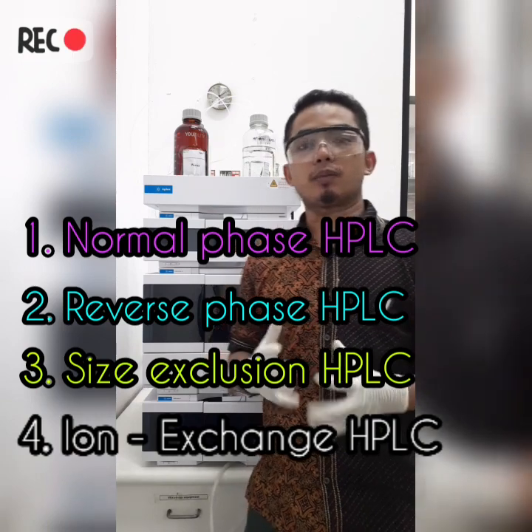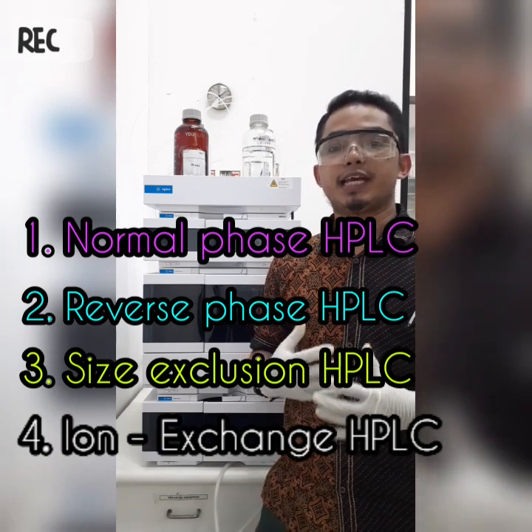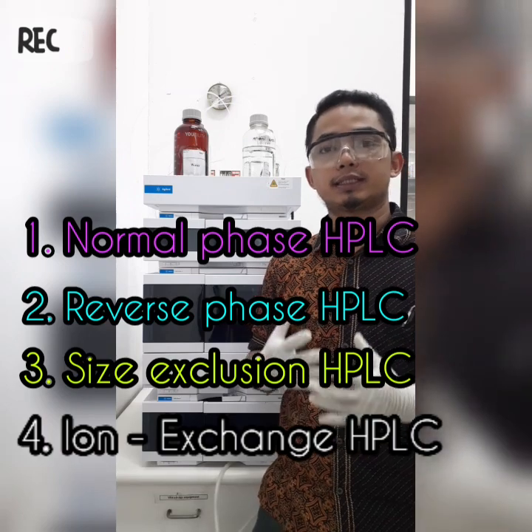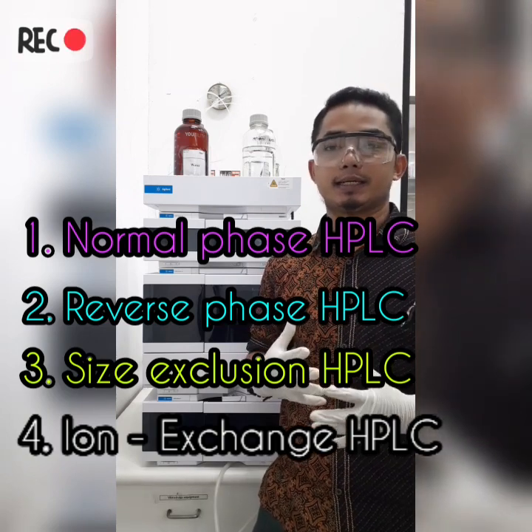Okay. Normal phase HPLC. This method separates analytes on the basis of polarity. NP-HPLC uses polar stationary phase and non-polar mobile phase. Therefore, the stationary phase is using silica.